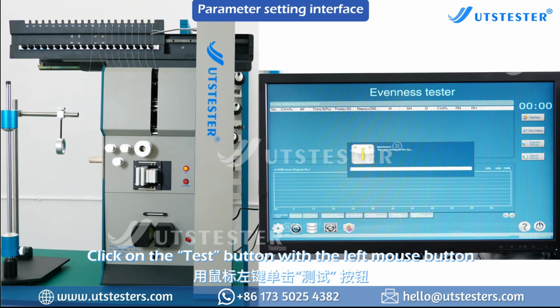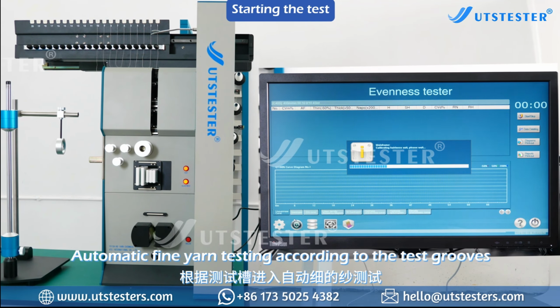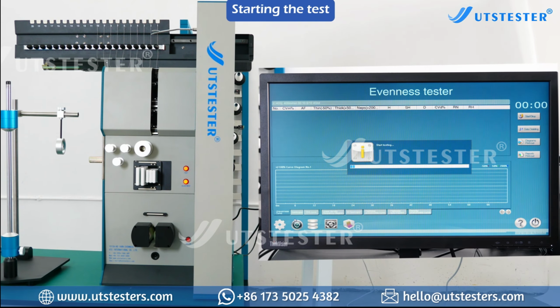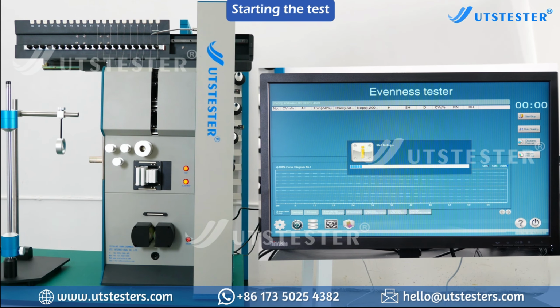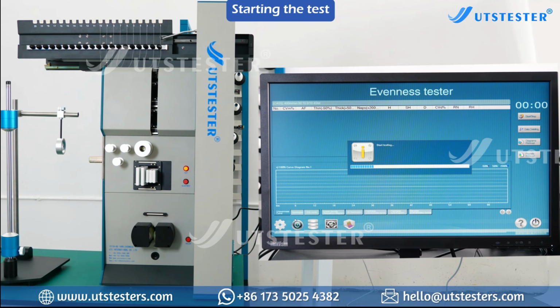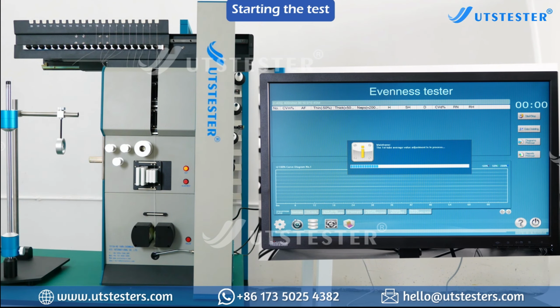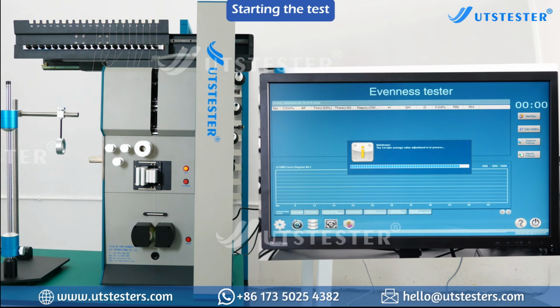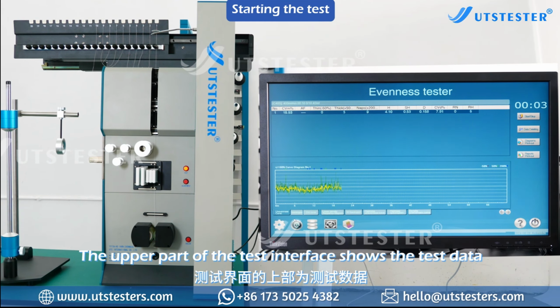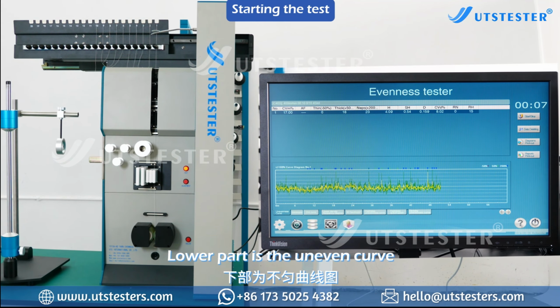Click on the Test button with the left mouse button. Automatic fine yarn testing according to the test grooves. The upper part of the test interface shows the test data. Refresh every second. The lower part is the uneven curve.